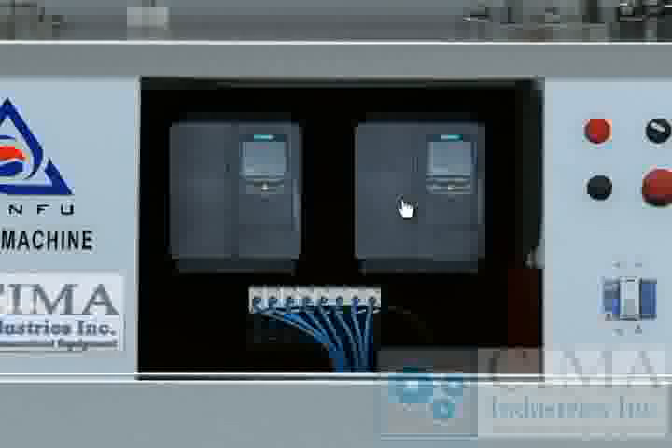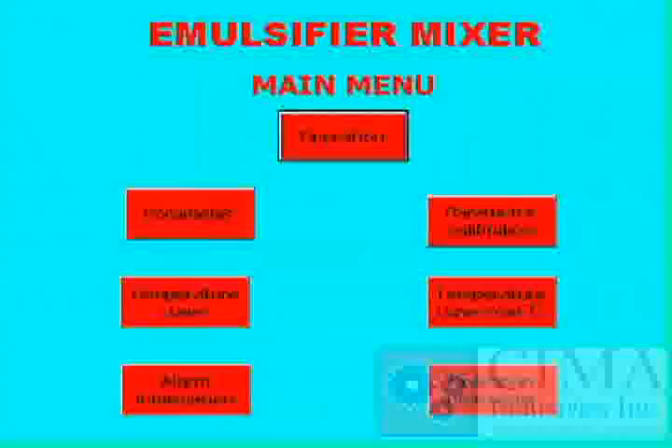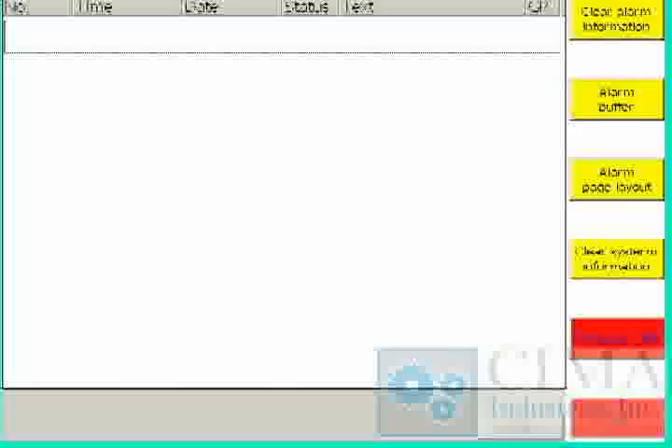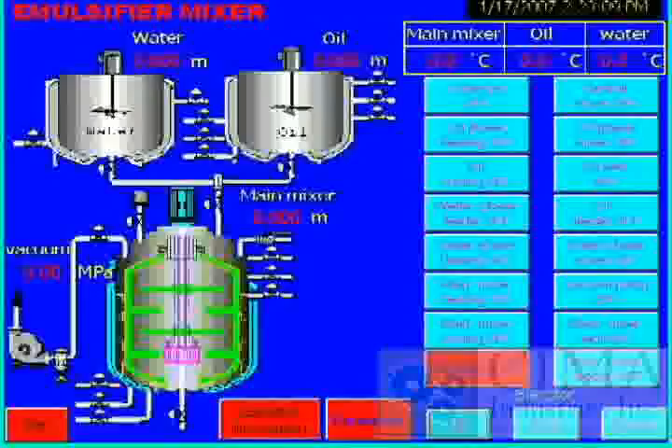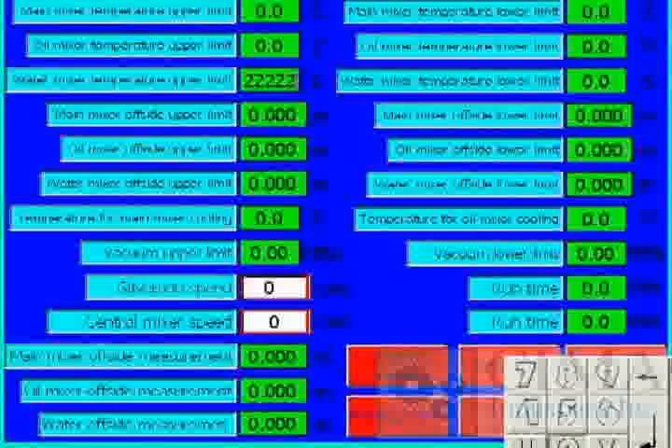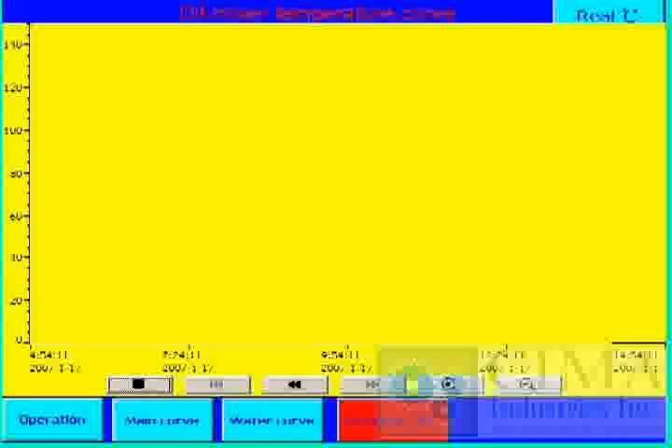The electric control system is made up of a PLC, circuit breaker, heat protector, touch screen, frequency converter, temperature transducer, and electromagnetic valve. The touch screen displays a control screen, parameter set screen, parameter updating screen, temperature curve screen, warning screen, and password protection. From the function screen, any screen can be accessed and any function controlled. Parameters can be easily changed from the parameter setting screen. Other parameters and functions displayed in the HMI include review of current parameters, temperature of the tank, alarm record, and plotting of time-temperature curves.